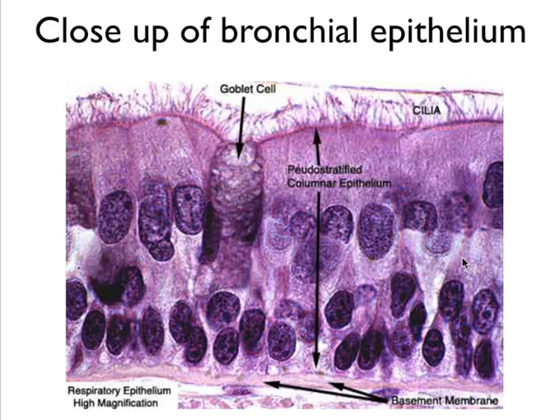So it looks like there are actually two layers of epithelial cells here. Here the layer of ciliated cells, and here the layer of basal epithelial cells. So it only looks like it's two layers, so that's why we call it pseudostratified, because it looks like two layers, but actually all of these cells touch the basement membrane. They're all somehow connected to the basement membrane.